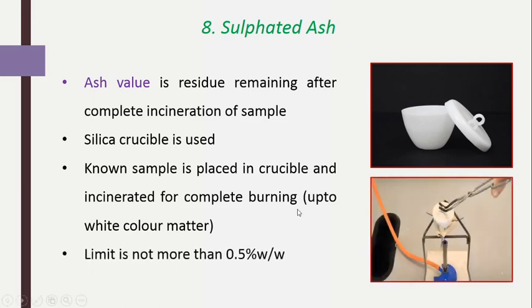You can see in this picture, after putting the sample in the silica crucible, it is subjected to the heat source, so direct heating takes place.